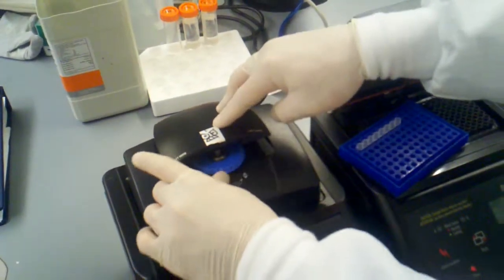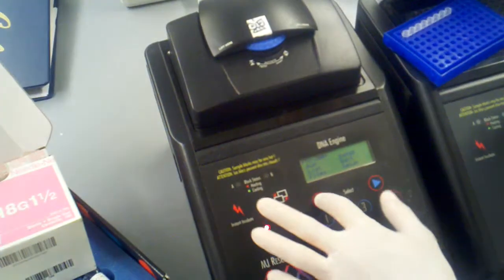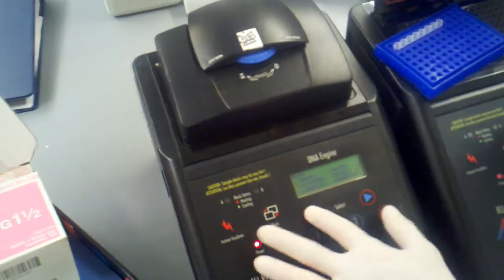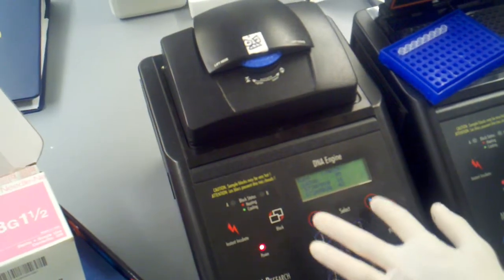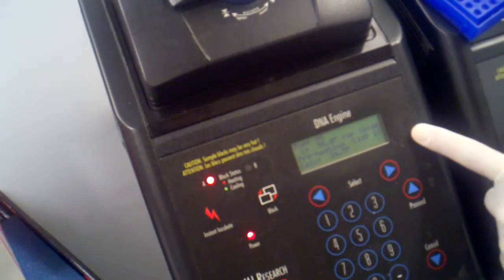I'm going to tighten the thermocycler. Go to block. Go to run. Go to, I think it's under main. And then we have a program called 95. Tubes. Doesn't really matter what volume. Heater lid, yes. And then this is going to run for 10 minutes at 95 degrees, after which point our proteins will be ready to be run on a protein gel. And that's it for now.